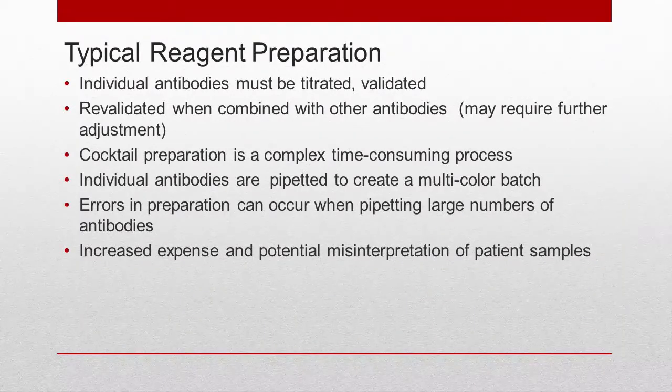The cocktail preparation is a time-consuming and quite complex process, and individual antibodies are pipetted to create multicolor batches, which improves efficiency within the lab. However, errors in preparation can occur when pipetting large numbers of antibodies, and any errors incurred when making these multicolor batches incur increased expense and potential misinterpretation of patient samples.